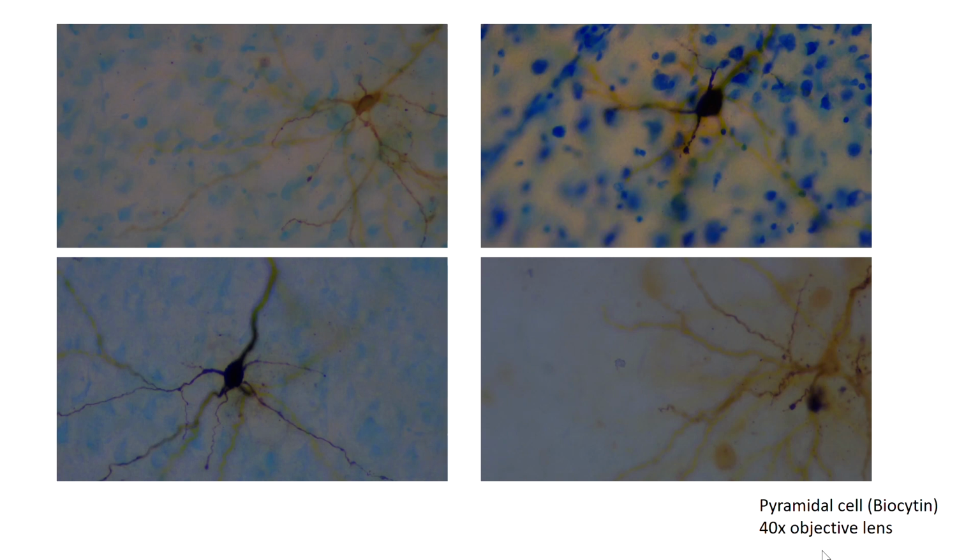Okay, so that is all about the microscopic brain examination. I know it's kind of hard for most of you guys because you probably have never seen this before, and that requires a little bit of spatial thinking. So if your grade is not ideal, don't feel frustrated, because that's just the way it is. I know it's hard, and if you keep up your hard work, you are going to get a good score in the end.